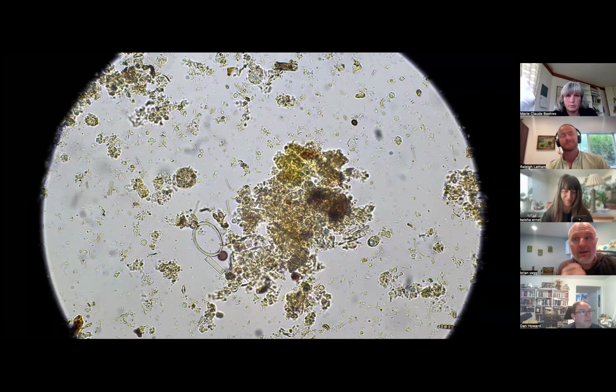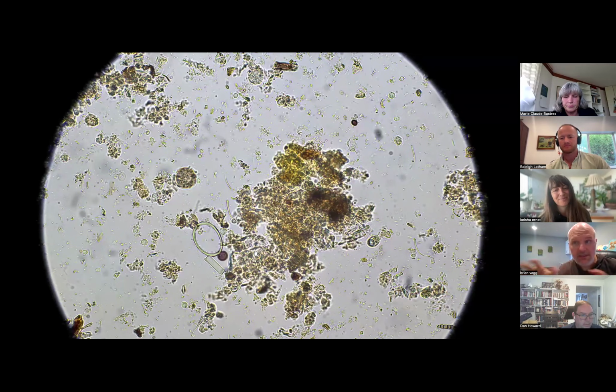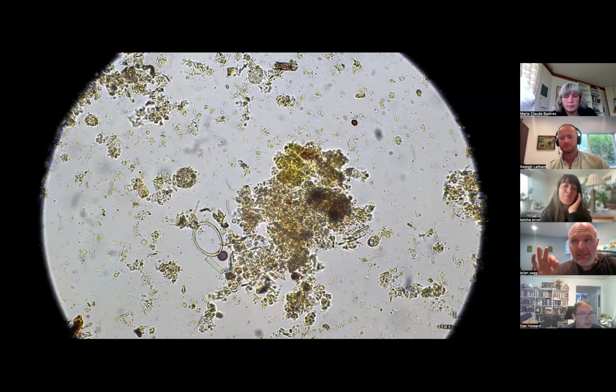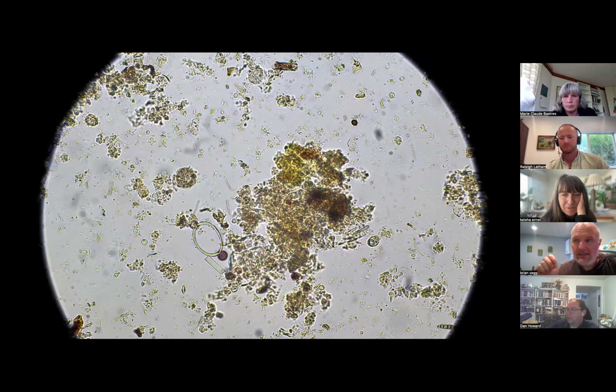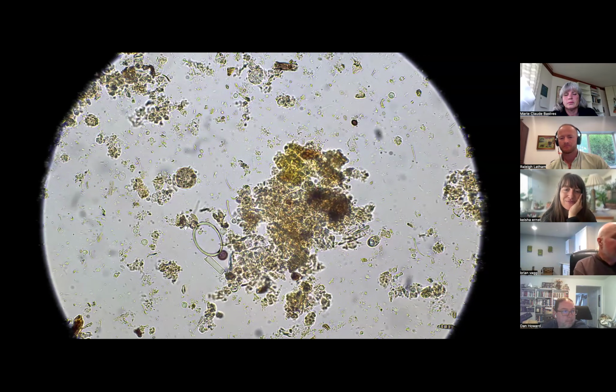Stomata. The stomata is the opening in plant leaves, where the oxygen and carbon dioxide transfer actually happens. The material that makes up the stomata is really, really hard to break down. It's one of the last things to break down from the organic matter, and a lot of times you'll see these rings in there. So I'm pretty sure that's probably a stomata.